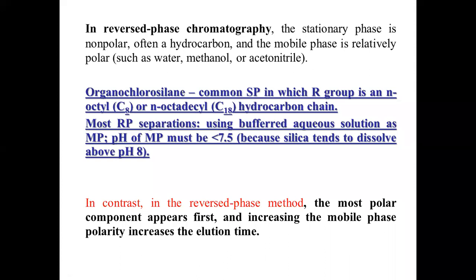So in normal phase liquid chromatography, the stationary phase was polar. In reverse phase HPLC, we are going to reverse the polarity of the stationary and mobile phases.